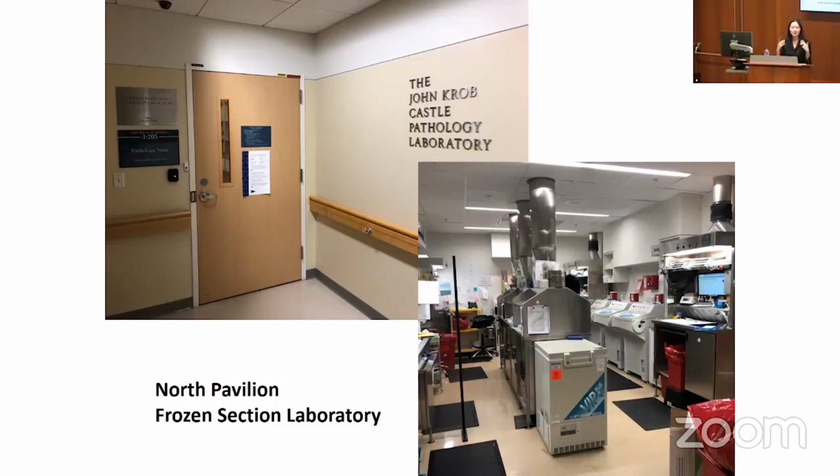Pathologists serve as eyes for surgeons. So when they're taking out a bigger specimen and they're looking at margins, what we're doing is under 20 minutes, and usually it's about 10, 15 minutes, we can do a rapid assessment of clear, not clear margins. But this is also the room where all the biopsies congregate. So everything that ends up in tissue diagnosis will come to this room.